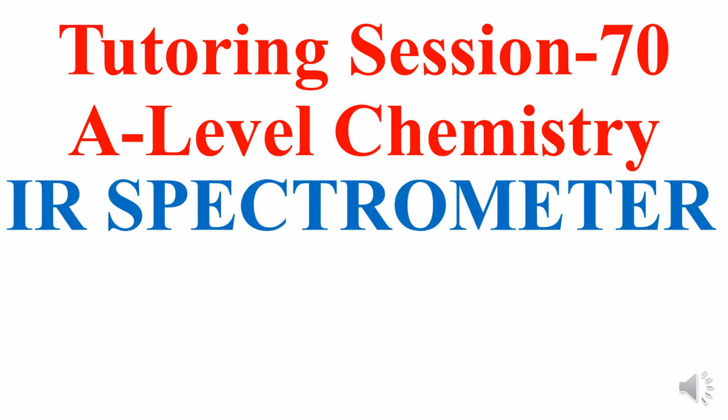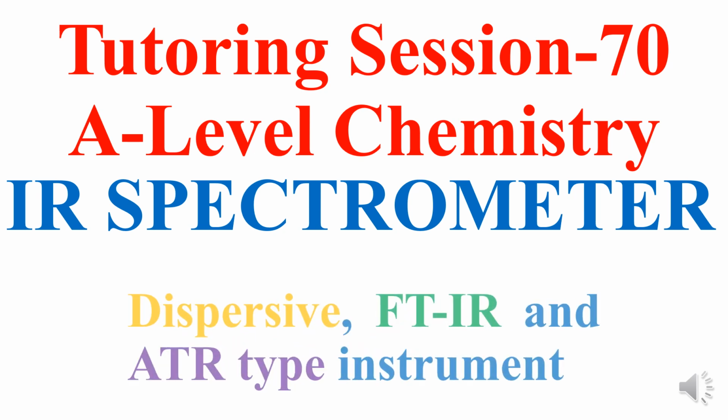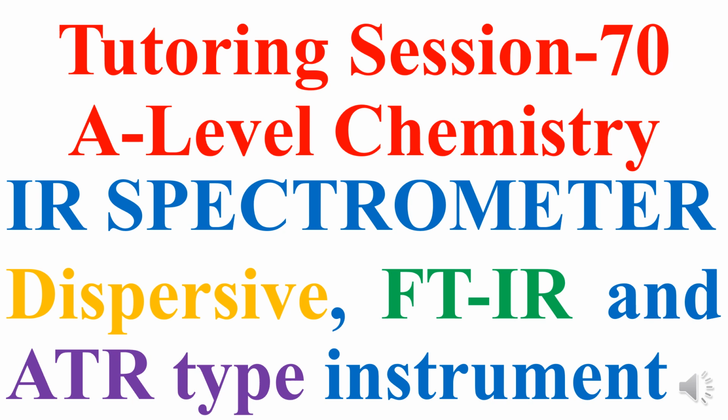In this video, I'll explain the working principle involved in IR spectrometer. Now there are three types of IR spectrometer instrument: dispersive type, Fourier transform type, and ATR type. Now the dispersive type instrument uses the monochromator, while the Fourier transform type IR spectrometer utilizes the interferometer.